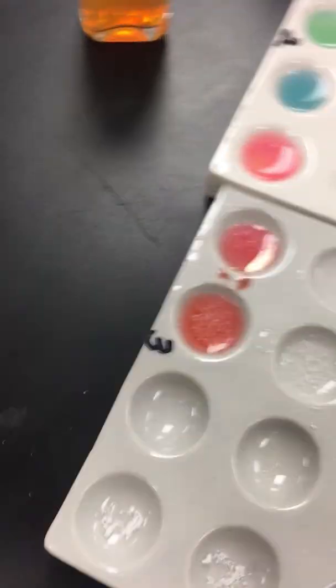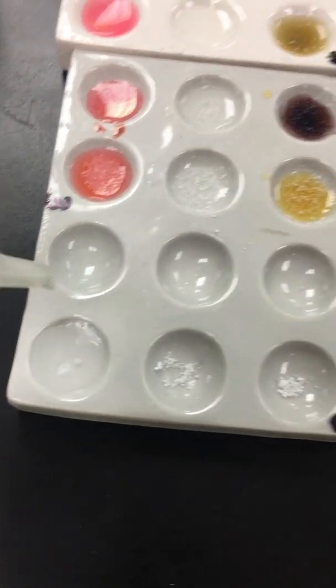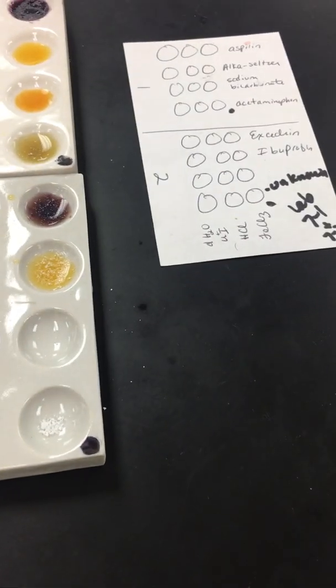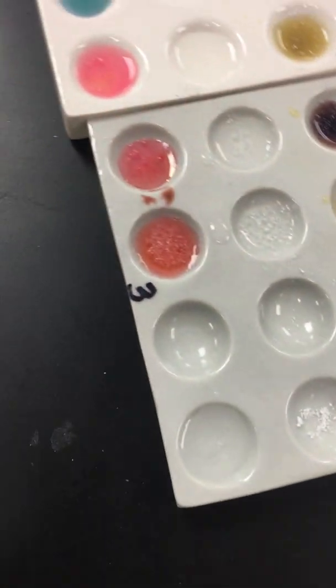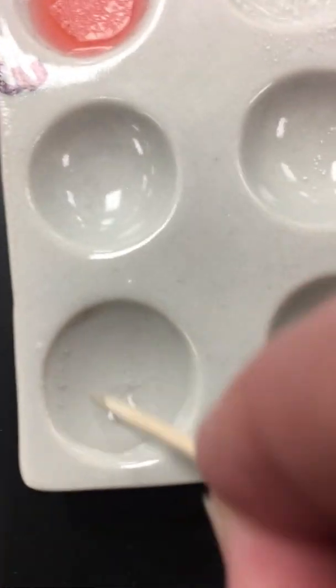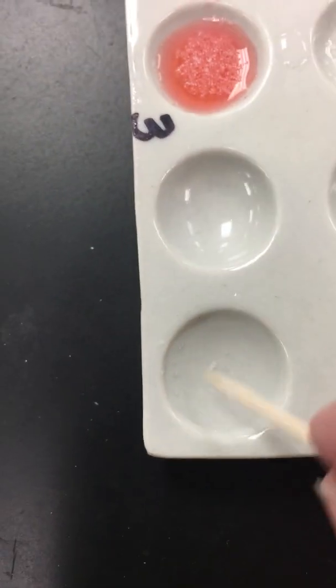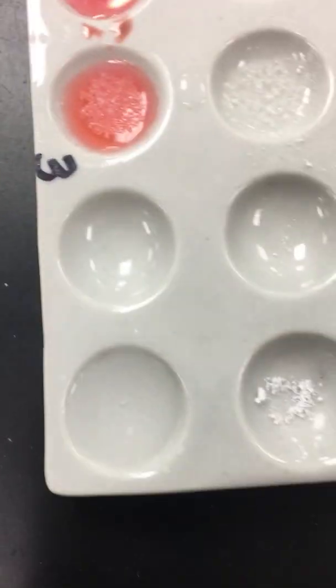All right, so we're going to start off again with our distilled water test. See how it reacts. So here is the distilled water. It looks like it's mostly dissolved. Maybe a little bubble there. And now let's add the universal indicator.